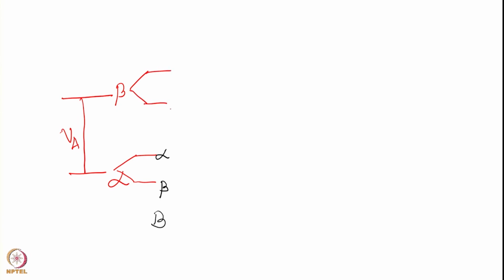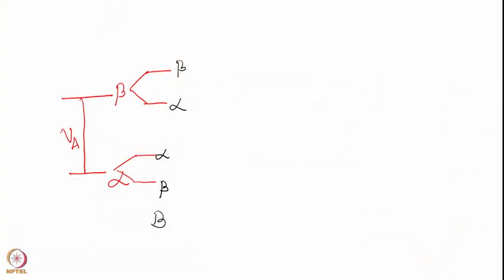And the beta with the alpha goes down. So, this is the alpha and this is the beta, because for I1 dot I2, if the 2 are in the same direction, it will be positive energy. If they are in the opposite direction, then it will be negative energy. So, therefore, beta alpha goes down, beta beta goes up, alpha alpha goes up, alpha beta goes down. So, therefore, we will have these orientations like this. And what is this energy separation here? This will be of the order of a few hertz, and that is J, that is the J which is indicated.